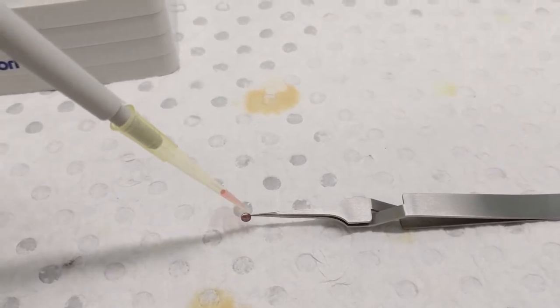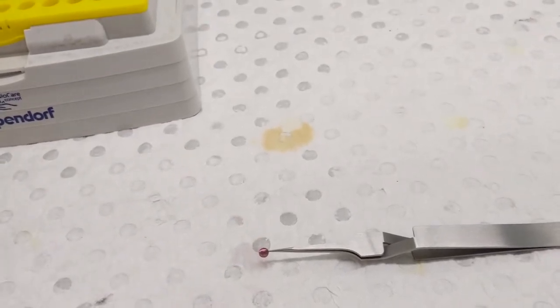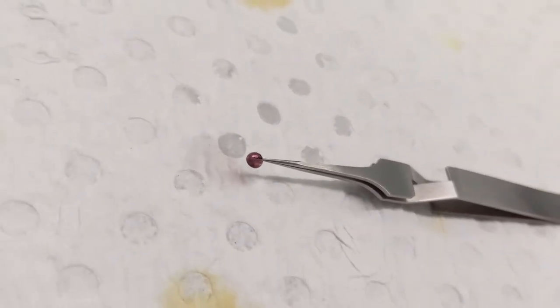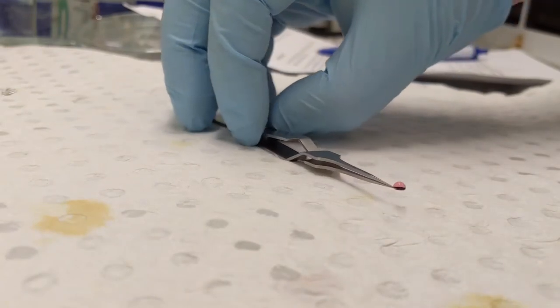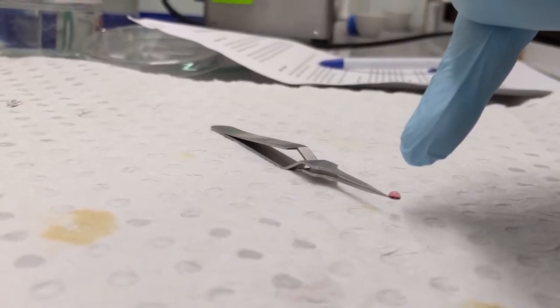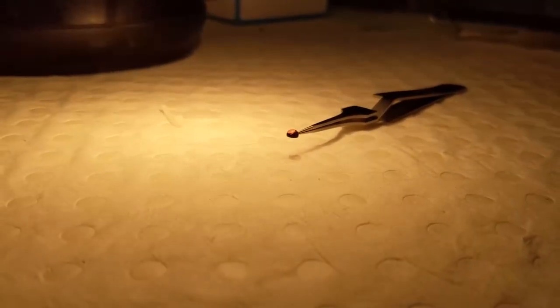Okay. So that was a little bit less than 20 microliters. Now we have the sample on the TEM grid, and if I get that into focus, you should be able to see the droplet formed. And this droplet will take approximately an hour to evaporate. Here is the sample under the light. So we are just trying to speed up the process of evaporation.